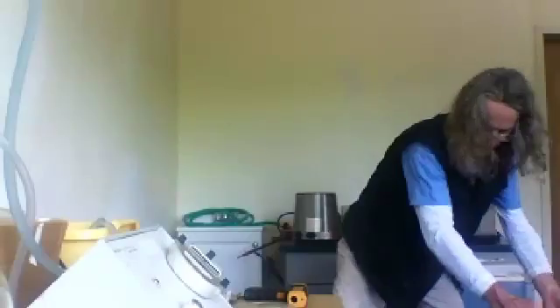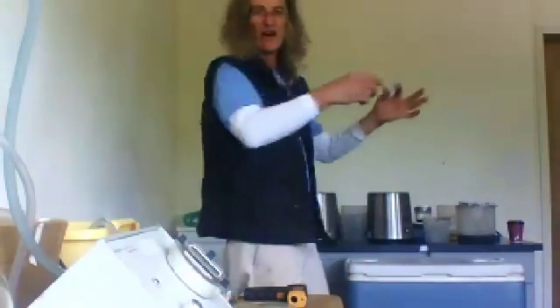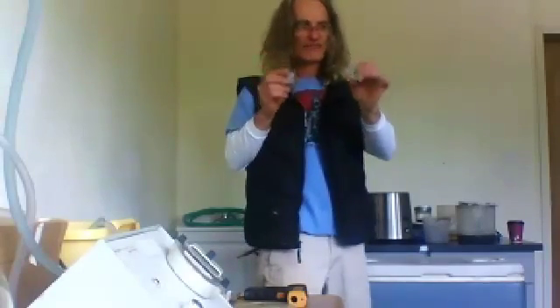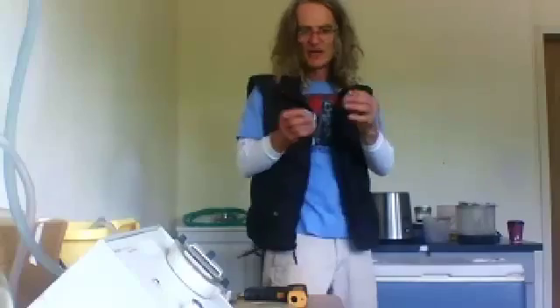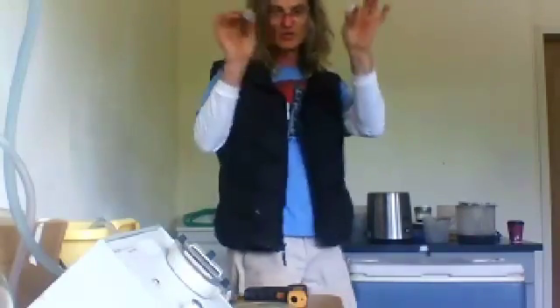Like attitude. Attitude's everything. Anyway, I got these sampled in there. I'm videotaping it with the camera, and they're going to add methanol, take it off using a very fine scale, but you'll see all that stuff. So they're taking 2 samples. I haven't told them which ones are which, so keep them in the dark. Back in about 5 minutes.